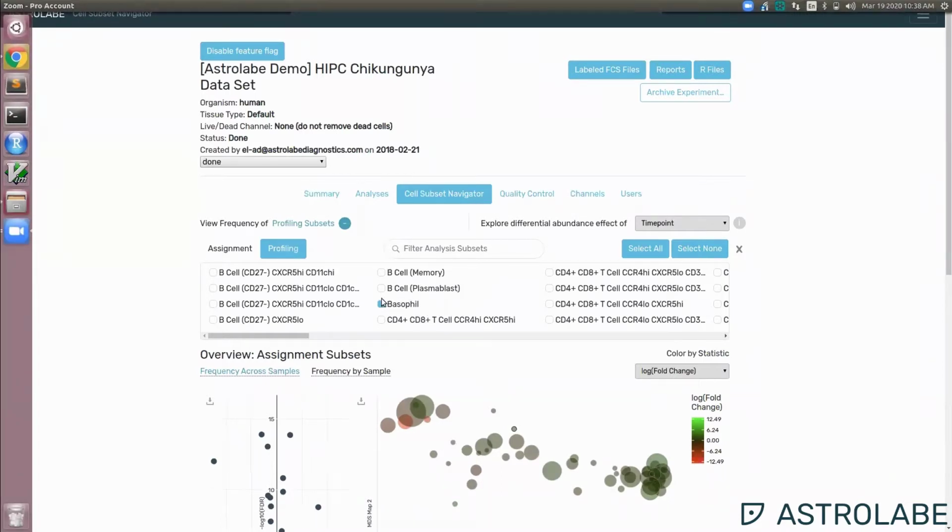Next question is, are there plans to make, if this is even possible, a version for single-cell RNA-seq data? At the moment, Astrolabe is designed for panel-based data sets only. We are using the platform for mass cytometry, flow cytometry, and we've also applied it to the panel-based element of CITE-seq using the TotalSeq kit from BioLegend.